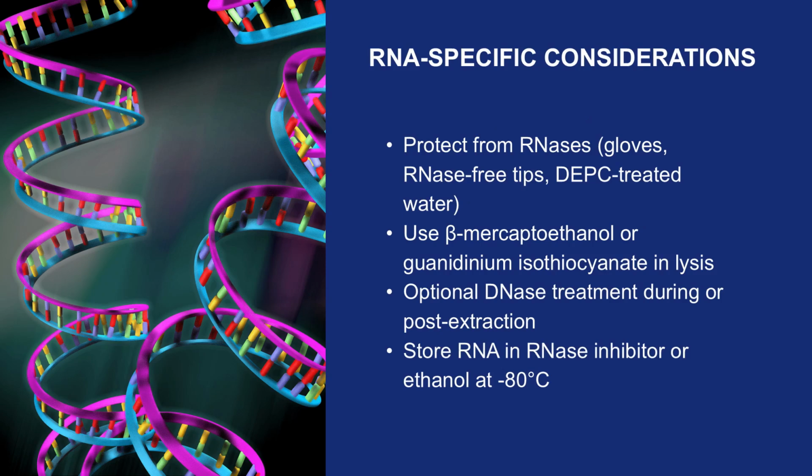RNA is much more sensitive than DNA due to the ubiquitous presence of RNases. Always wear gloves, use RNase-free consumables, and treat surfaces or solutions with DEPC when needed. Use lysis buffers containing guanidinium isothiocyanate or beta-mercaptoethanol to denature RNases.